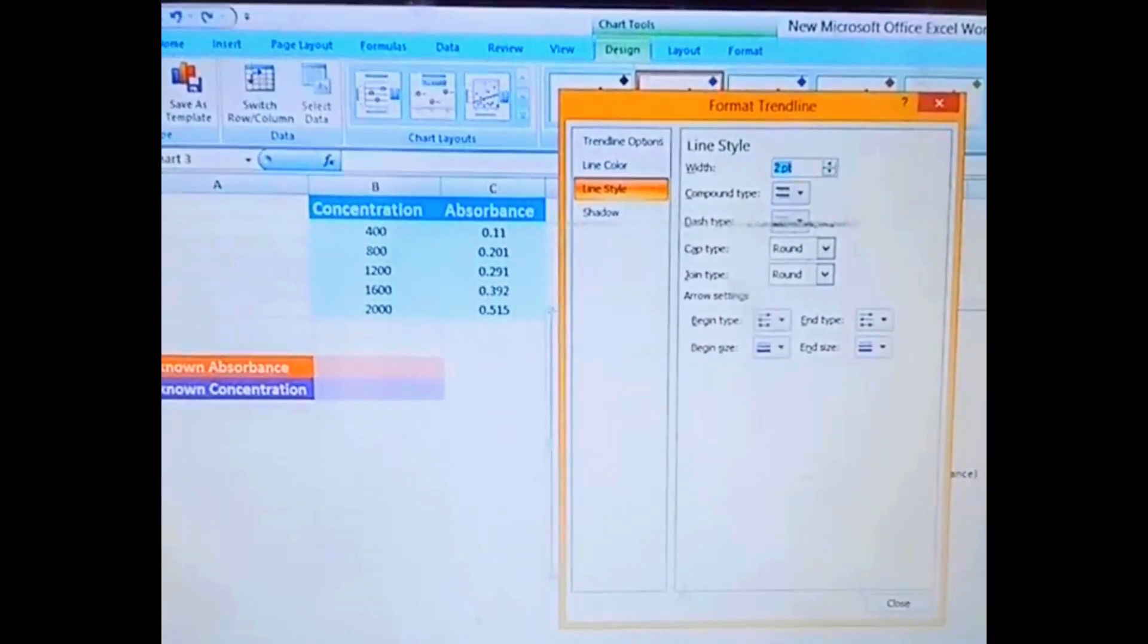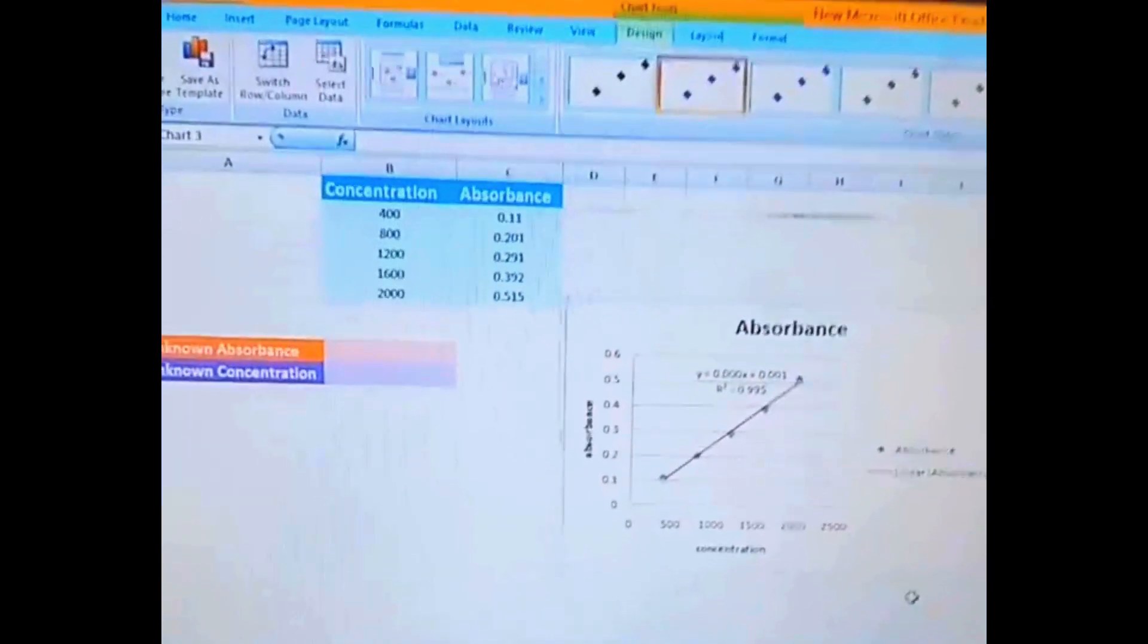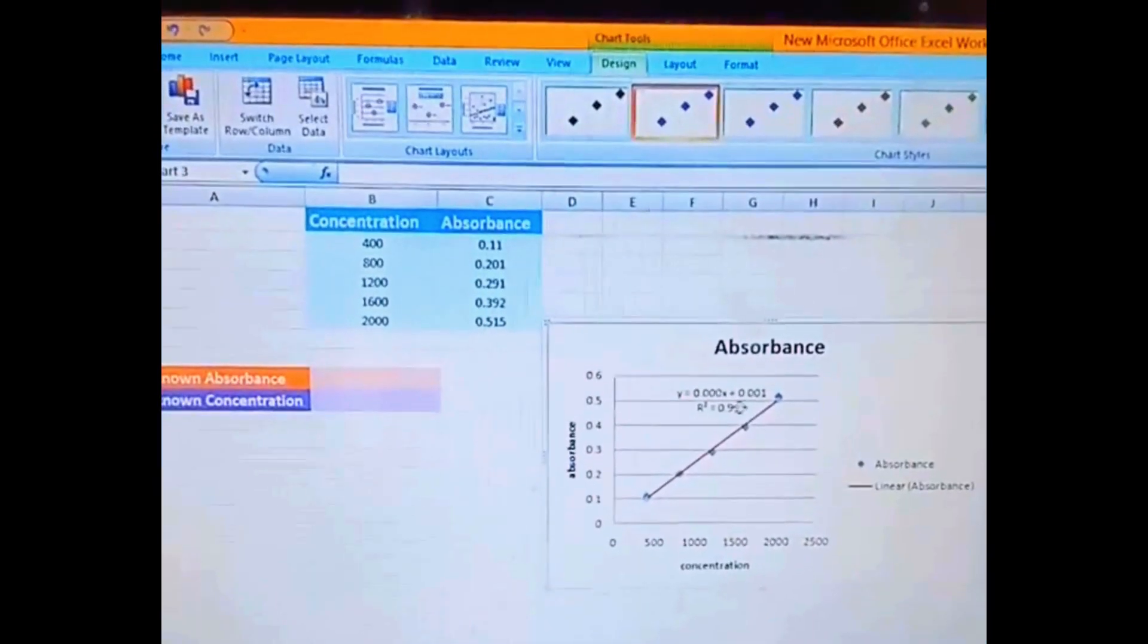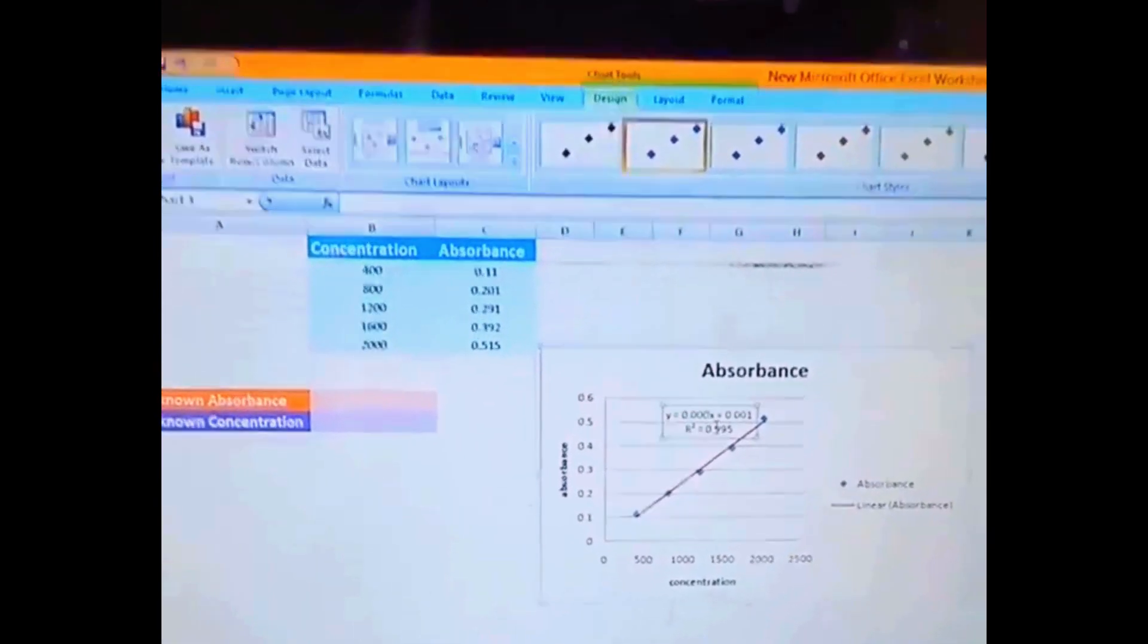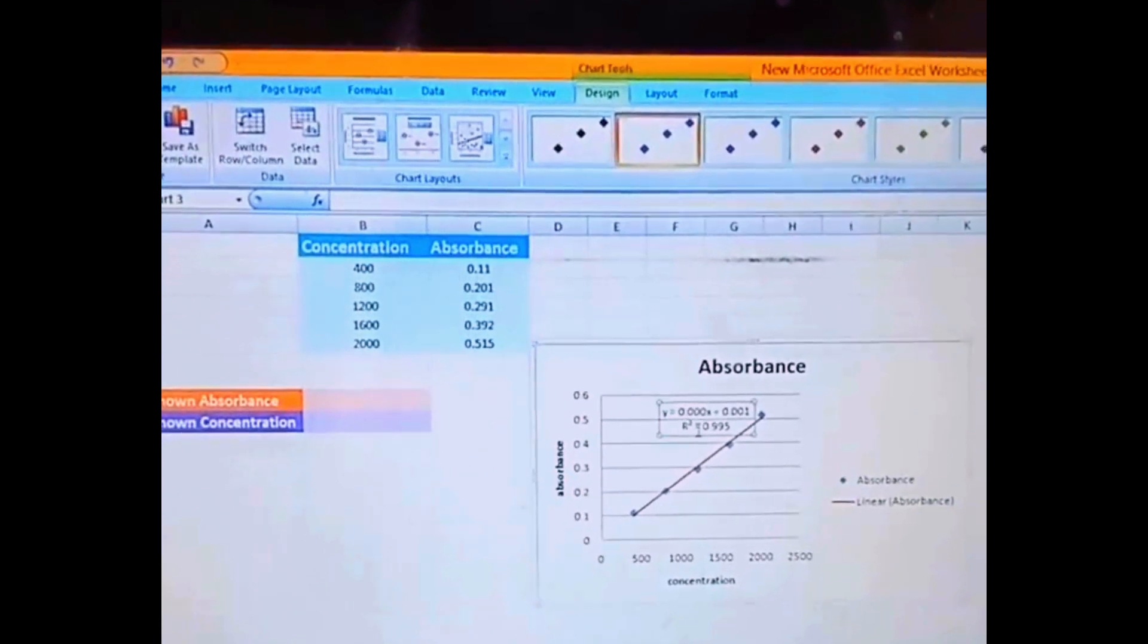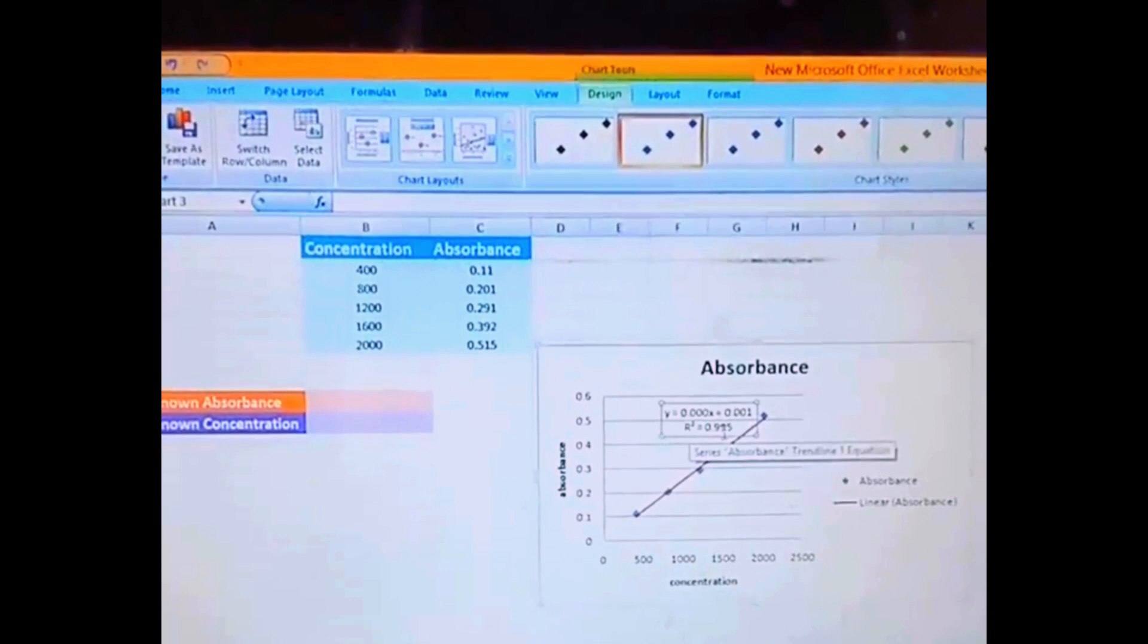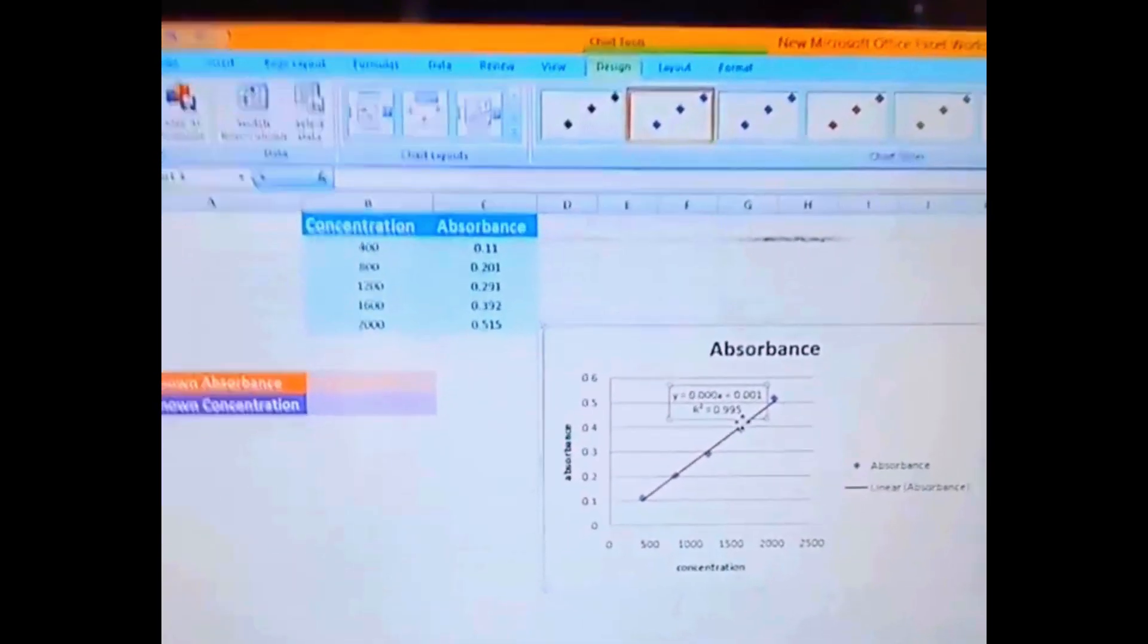Here we can pick our width and whatever thing by which we want to represent our data. So here is the trendline, here is the formula, and here is also the R-square value, that is 0.995.